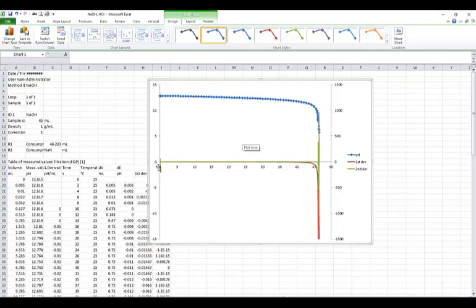You do run into a little bit of issue with this y-axis on the left, the primary y-axis, because it actually is two different things being plotted there, and they have different units. So pH has no units, but the first derivative does have units. So you could indicate clearly on the axis label the two different possibilities, or you could put the units for the derivatives in the legend. So a couple of different options there. You could then label the secondary y-axis as being second derivative and include the units. So add some titles, and label the axes.